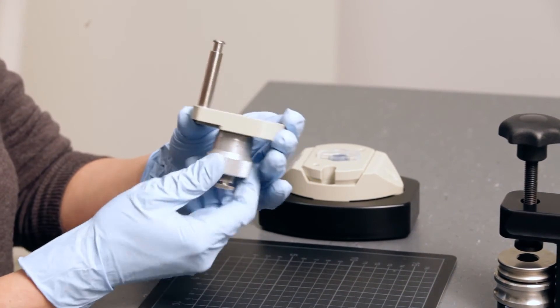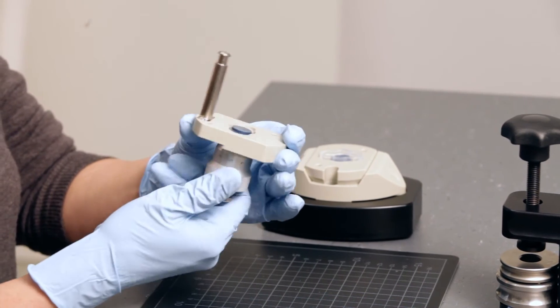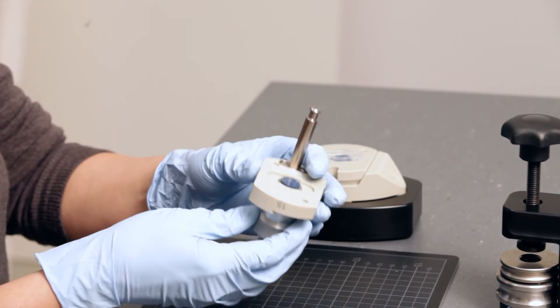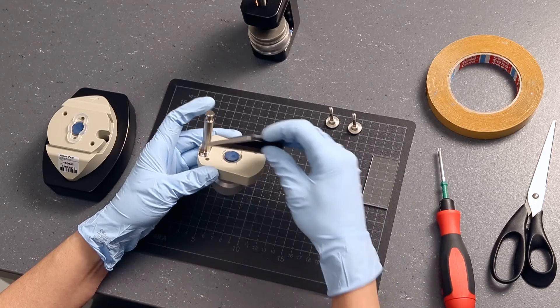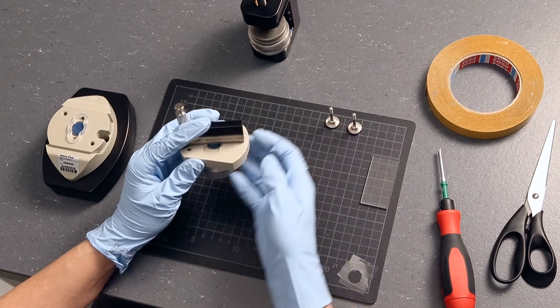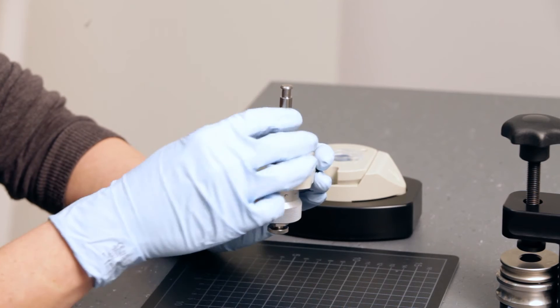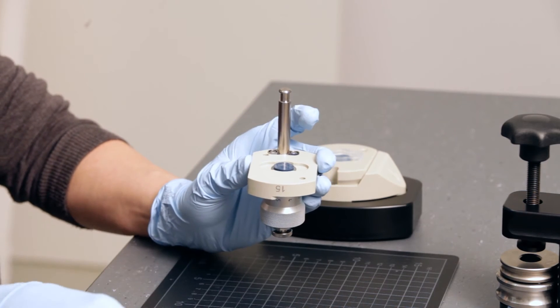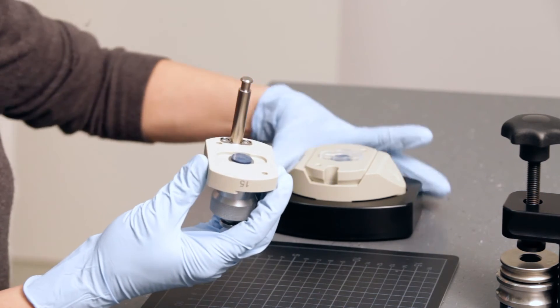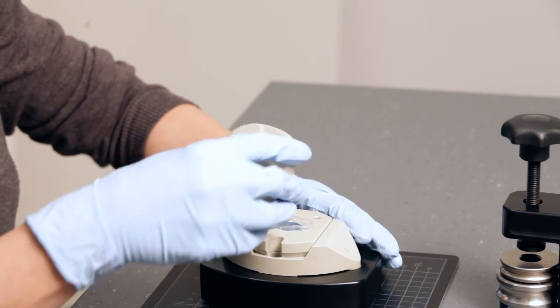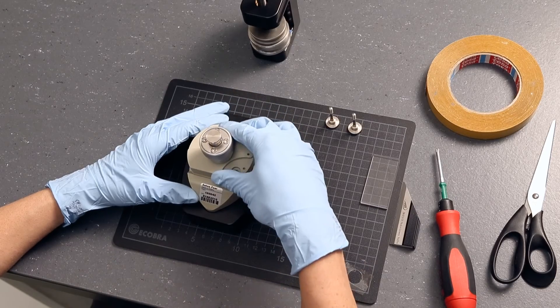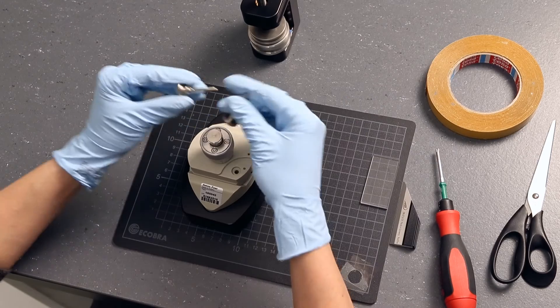Level the position of the sample surface with the adjustment knob. Use the straight edge for fine adjustment. Close the measuring cell and tighten both halves with the screws.